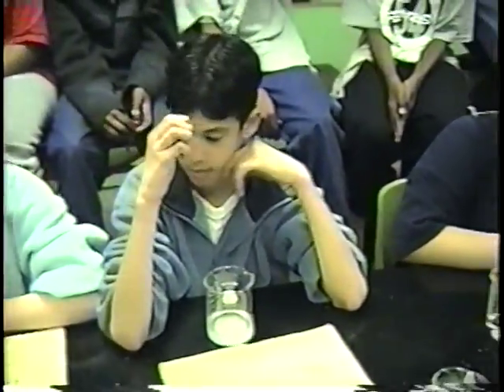Who has that? Shama's one is the control. What's different about Shama's beaker than anybody else's beaker? Because hers has no added chemicals. Right. She has no variables at all in her beakers. So the standard, what everything is based on here, is based on Shama's water. Okay? So the thing that has no variables and becomes the standard for the experiment, that's called the control. So the water is the control.